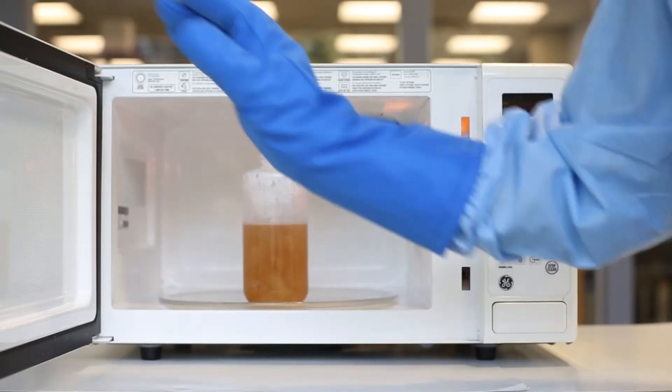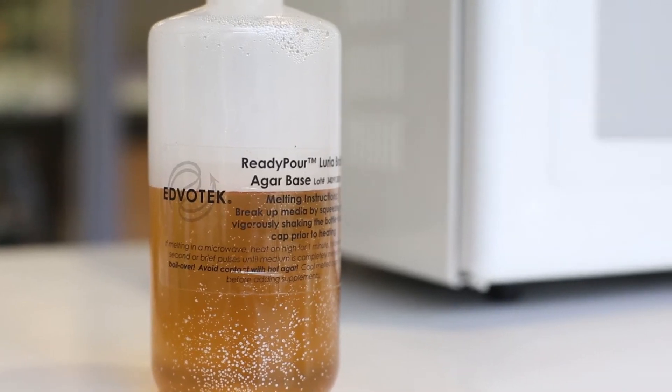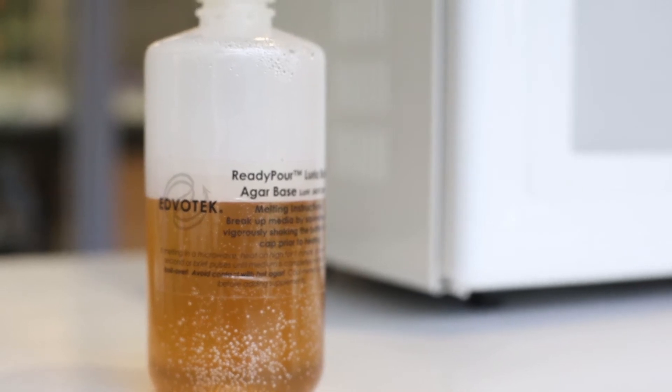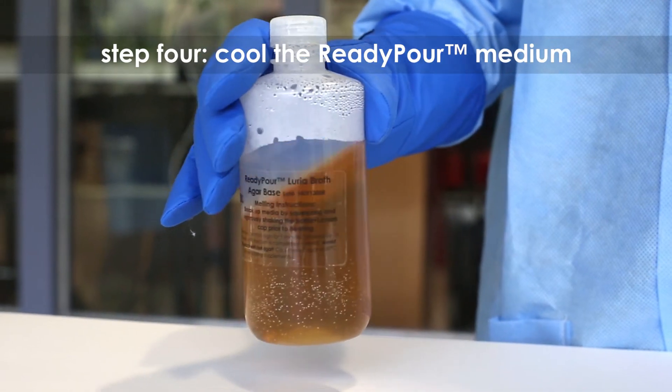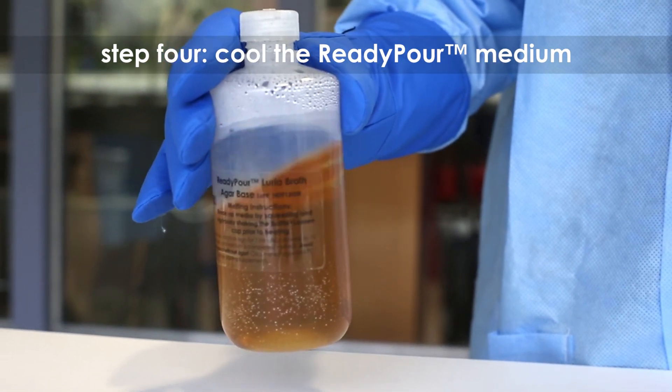Continue to heat the solution in 20 to 30 second intervals until the agar is completely dissolved. Keep a close eye on the medium to prevent it from boiling over.